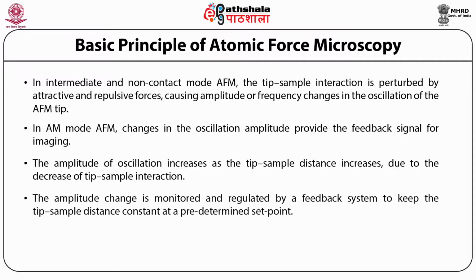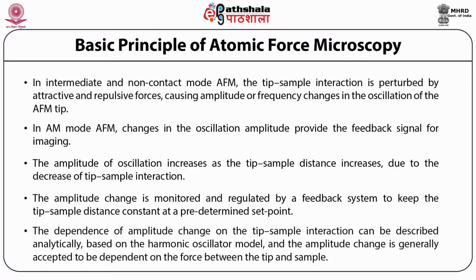The amplitude change is monitored and regulated by a feedback system to keep the tip sample distance constant at a predetermined set point. The dependence of amplitude change on the tip sample interaction can be described analytically based on the harmonic oscillator model, and the amplitude change is generally accepted to be dependent on the force between the tip and the sample. Therefore, AM mode measurements represent the direct force between the tip and the sample.